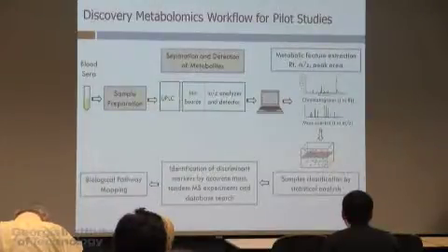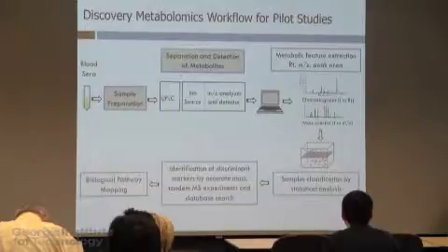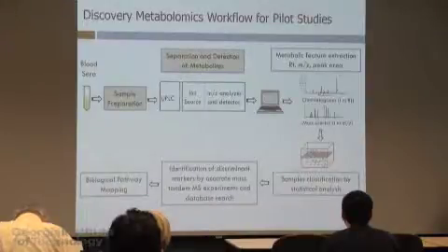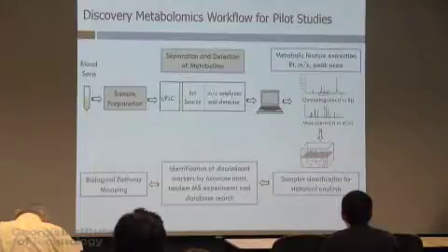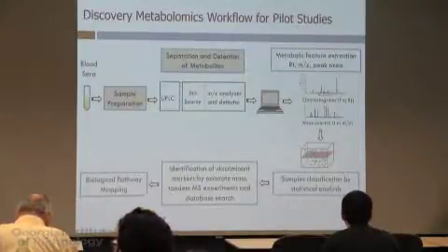You're going to extract the peaks from that data. And you're going to align the peaks. So you want to make sure that you're comparing apples with apples. That step of extraction and alignment and integration, it's also where all the problems happen. So it's full of pitfalls. Very important that it's done right. But once you end up with this massive spreadsheet of features, we call them features. We don't even call them metabolites because we don't know what they are. You need to start figuring out what those are.